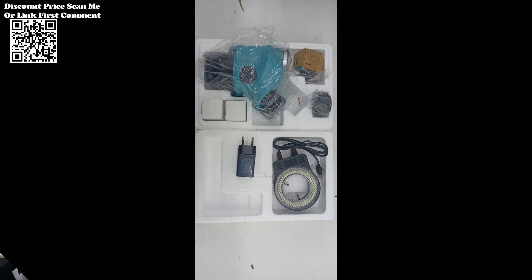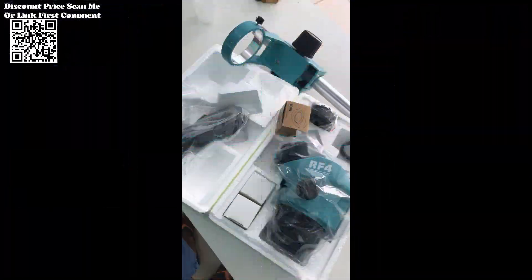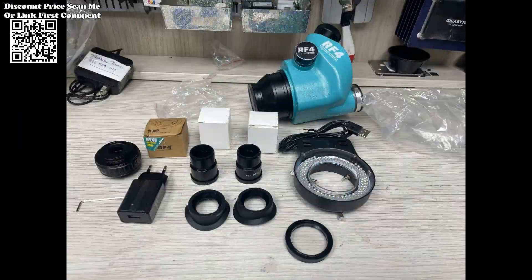Three-dimensional Imaging: Capture the full depth and dimensionality of objects with ease. The RF4 microscope is adept at accurately rendering concave and convex objects, providing a comprehensive three-dimensional view for precise analysis and evaluation.